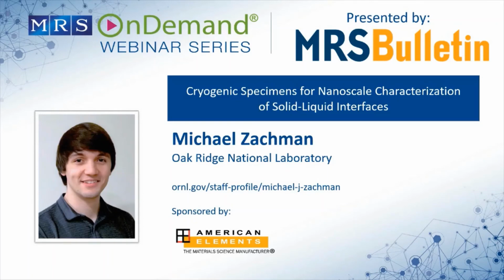So it's kind of the reverse of putting it into the microscope. You come out in a vacuum device, which is better than just the shield. And then you put it into the nitrogen. There's a split second between opening up that vacuum and going into the nitrogen where you could potentially have some more contamination, but that's supposed to be a nitrogen environment, so hopefully not. You go into the nitrogen pot, and then from there you can just store it in nitrogen until you end up at the same point that you would to load it into the microscope with the other samples. So it's kind of a three-step process of making it, getting it out of the FIB and storing it, and then moving it to the microscope.